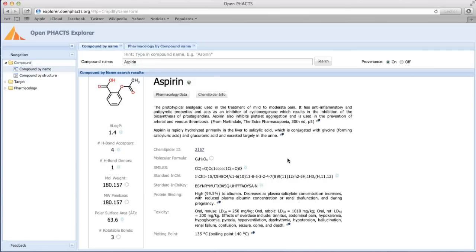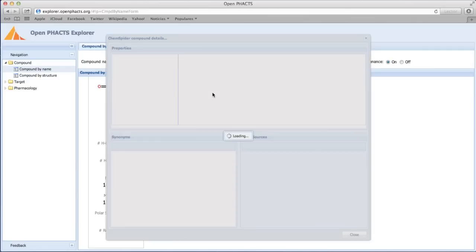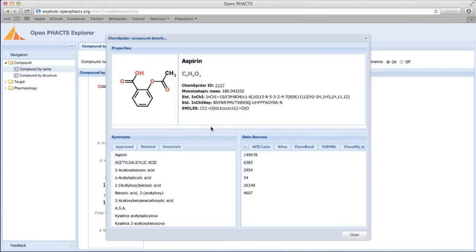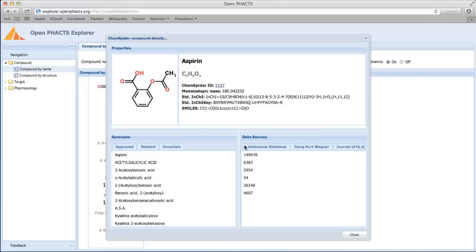We now return to the compound summary page and click on the ChemSpider button. This opens a ChemSpider widget within the Explorer, where you can get further compound-related information about Aspirin from other databases integrated within ChemSpider. In the data sources box, you can browse the data sources which have information on that compound and, where available, links will take you through to the relevant page on the data source.